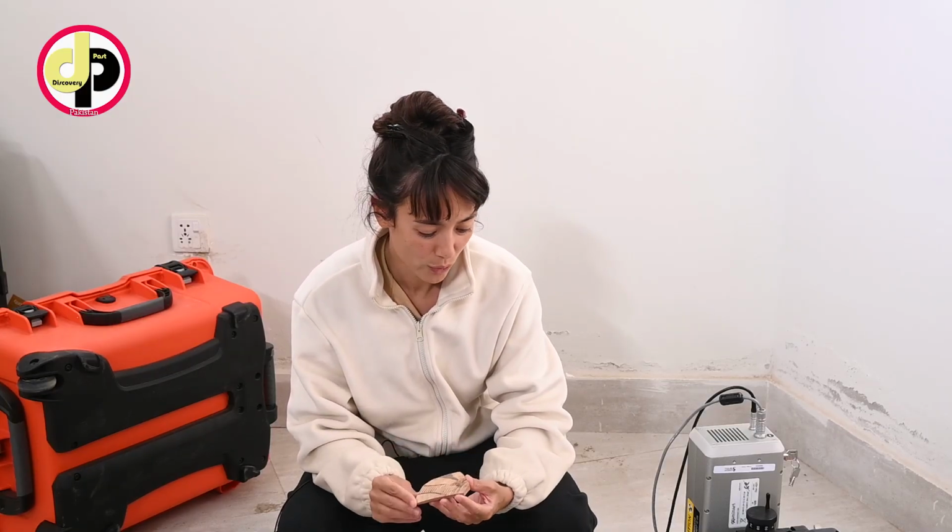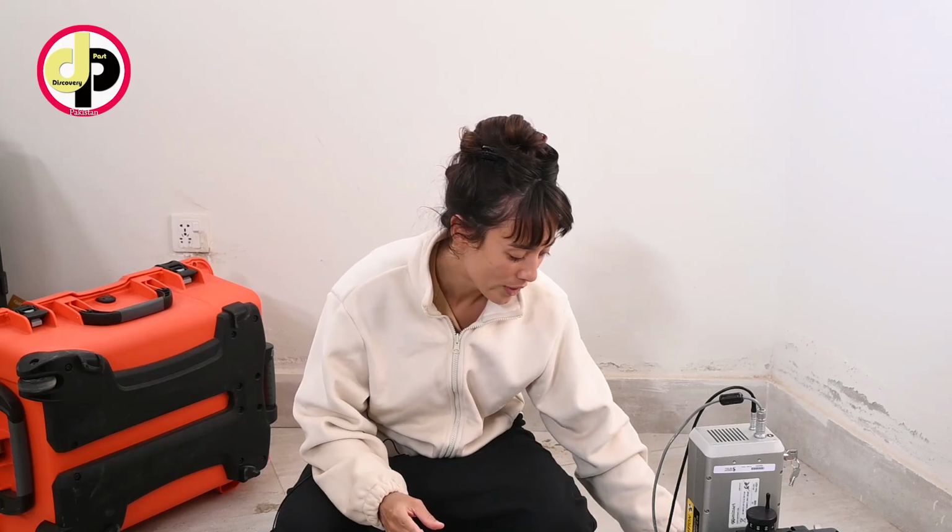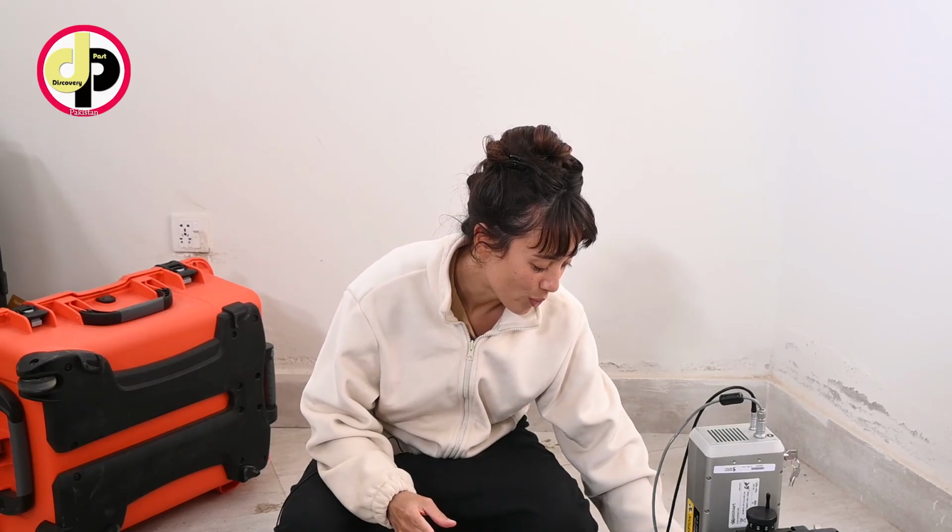So this is the methodology that we implemented here for the first time with some portable instruments to analyze different kinds of materials. And so it's the first test, and we will see the result of this first campaign, and maybe pursue it for the next season. So thank you very much.